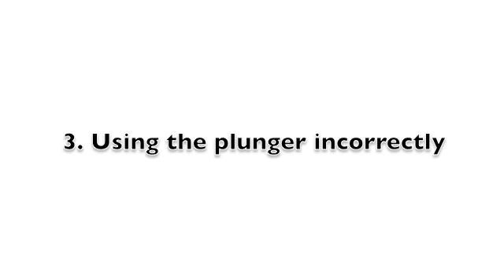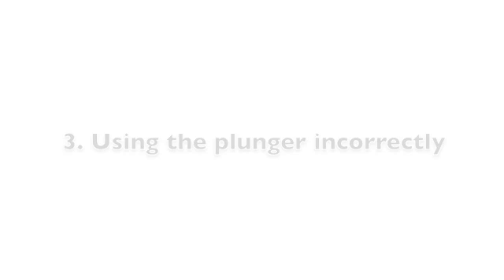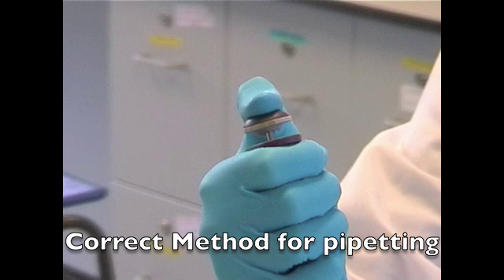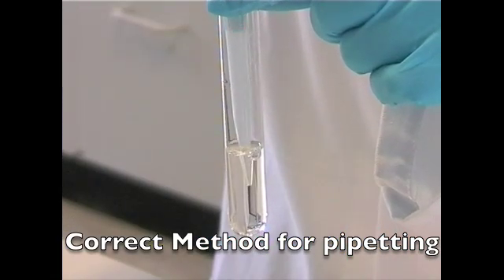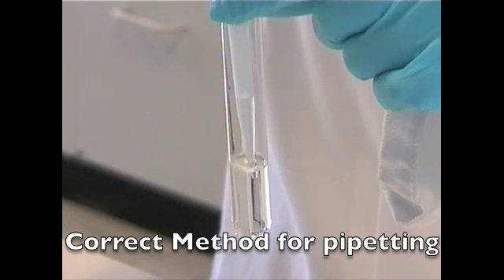Section 3: Using the plunger incorrectly. The correct method for pipetting is to depress the plunger to the first stop or point of resistance, immerse the tip in the liquid, and slowly release the plunger to its starting point.